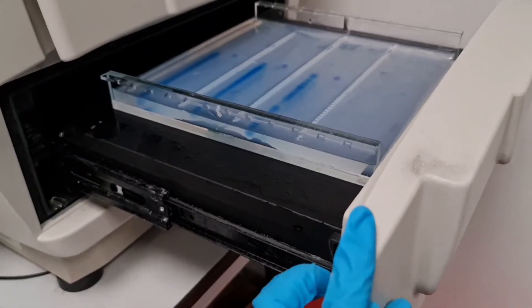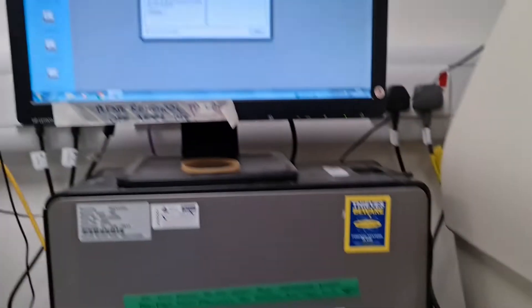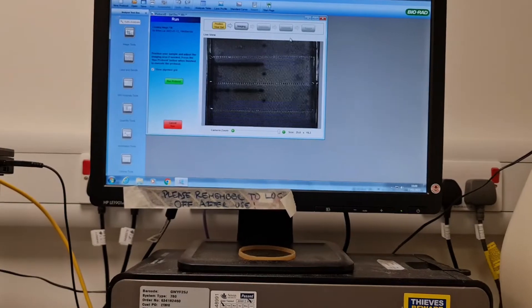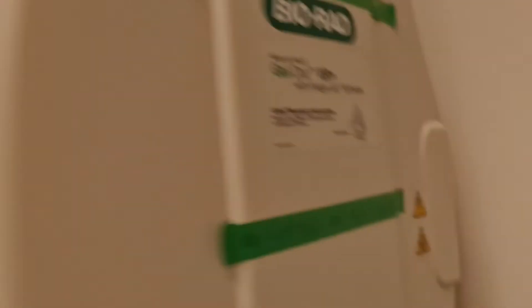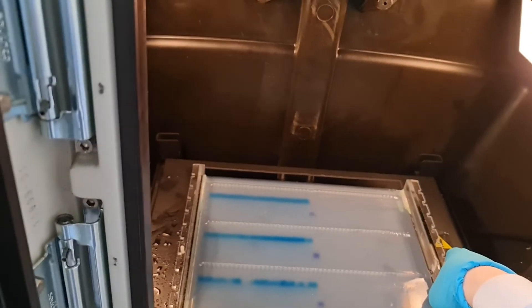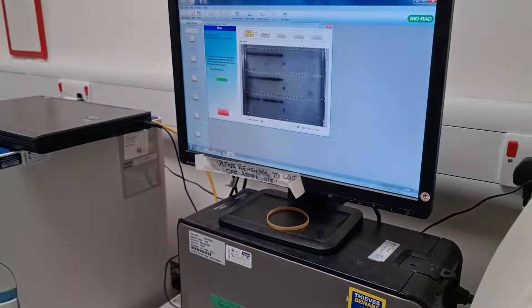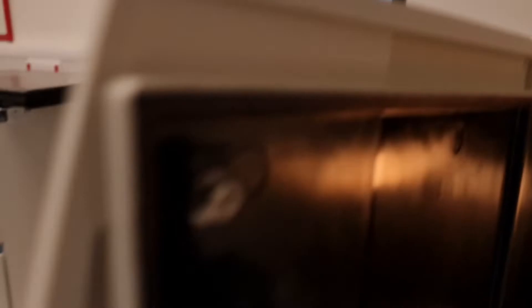I put the gel here on the machine, it goes inside, and then I use the software to position my gel. I just move it like this and check the monitor over there. It looks good.